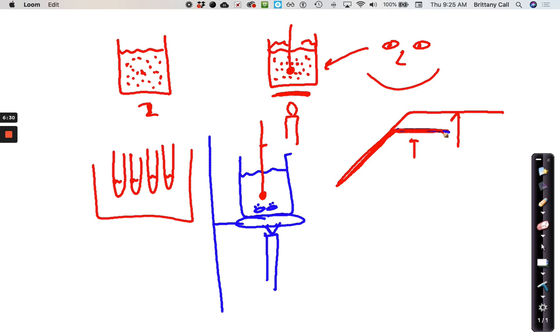Are you with me? Okay, so we'll turn off the burner. You're going to add any water that was lost, right? So when it boils, you know the water goes down, right? So you're going to grab another beaker and you're going to fill it back up to 150. Okay? Then you're going to carefully and slowly add one of the test tubes of salt in. Okay? We're going to add 1 test tube in.